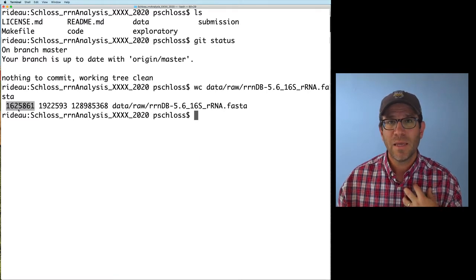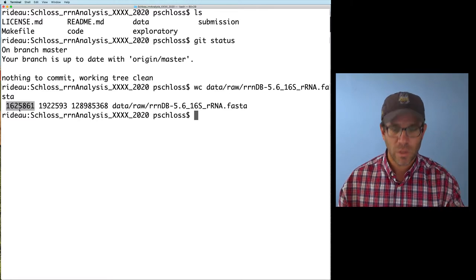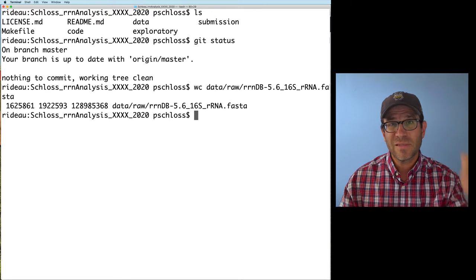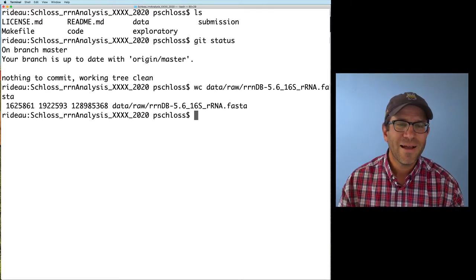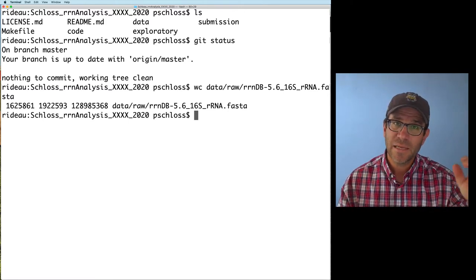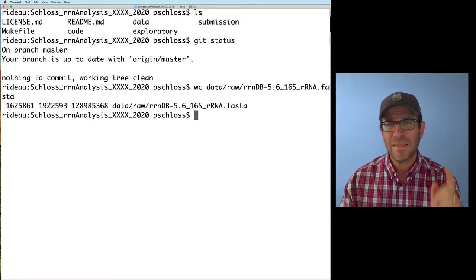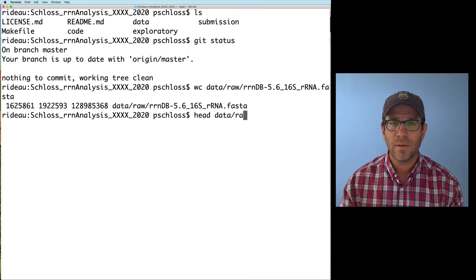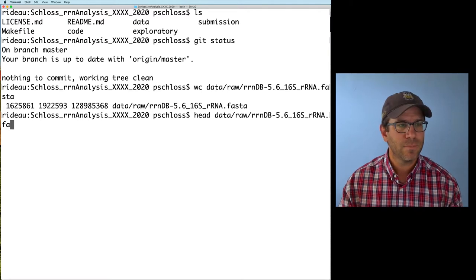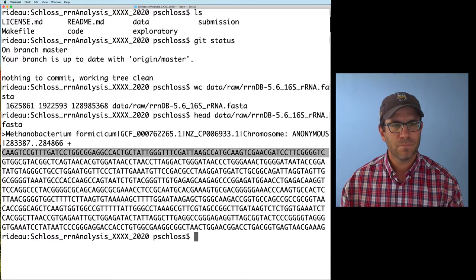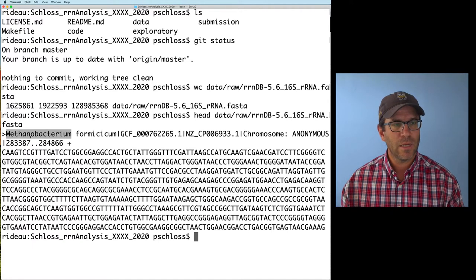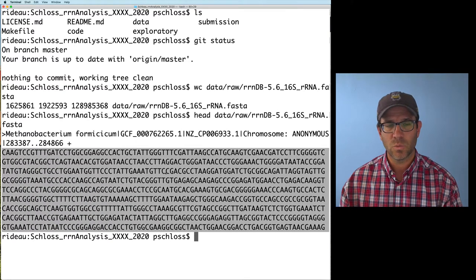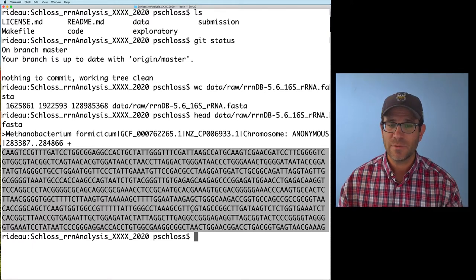A FASTA file can be formatted in one of two ways. In the format I typically deal with, each sequence is represented by two lines: the header starting with a greater-than sign, and the actual sequence data. But other formats represent the sequence across multiple lines, each maybe 80 or 100 characters wide. Using head on our file, we see each row is 80 characters wide, meaning each sequence spans many lines. So wc alone won't work.